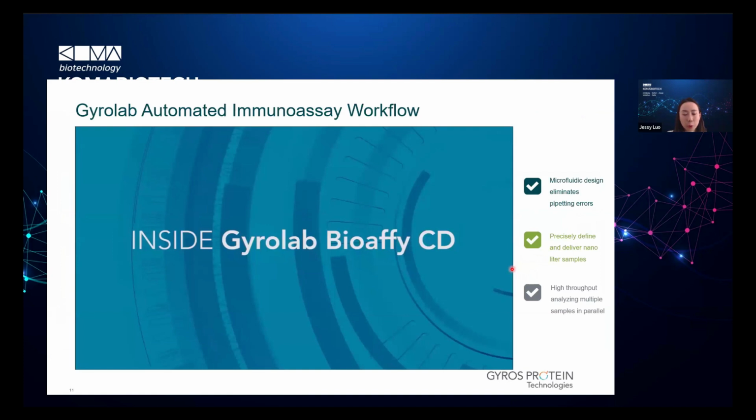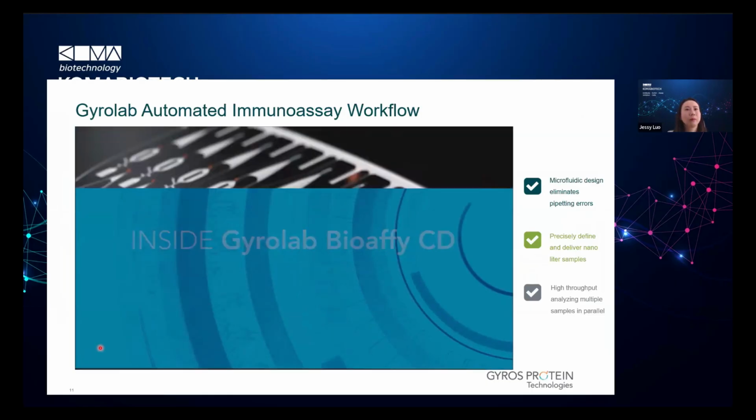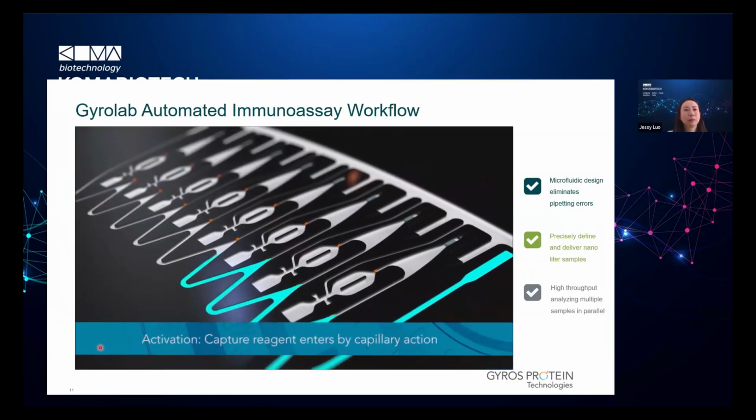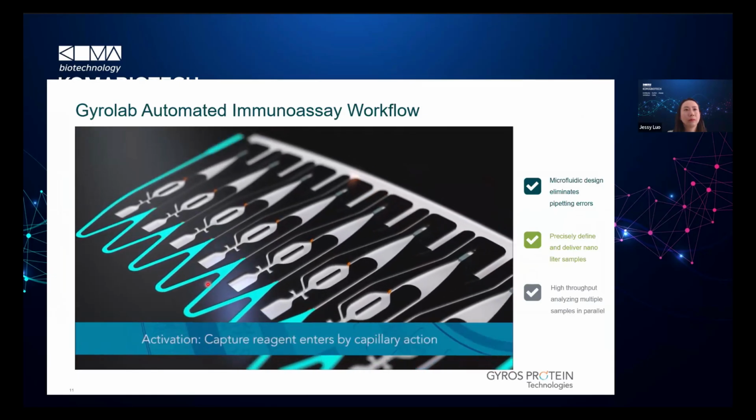Now, I'm going to show you a video that may better explain how this process works on Gyrolab. Let's take a close-up view of the CD. The biotinylated capture reagent is added to the common channel and drawn into the microstructures by capillary action.